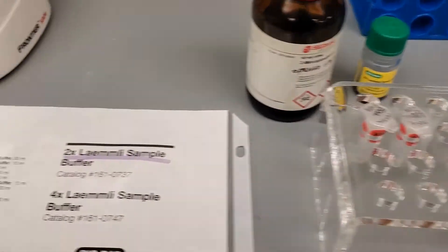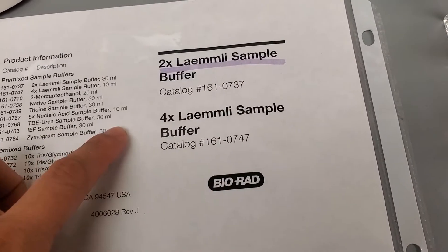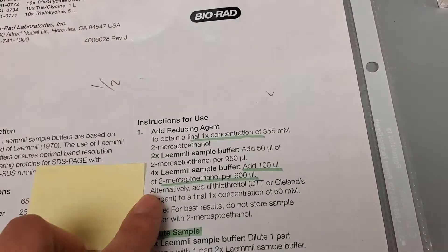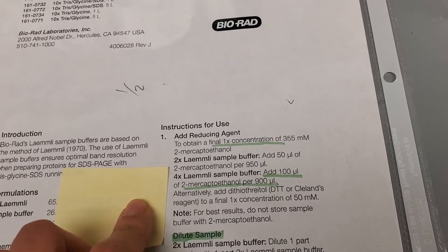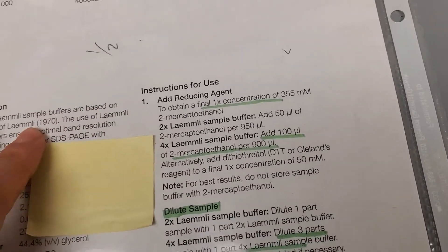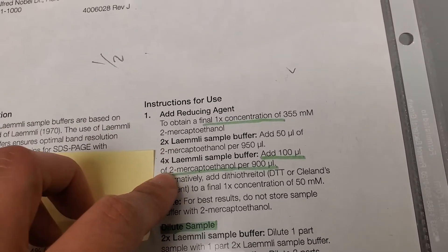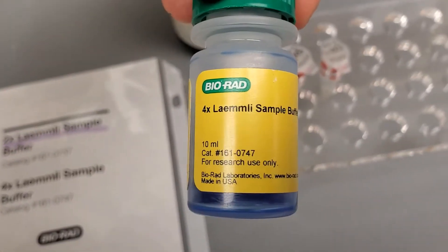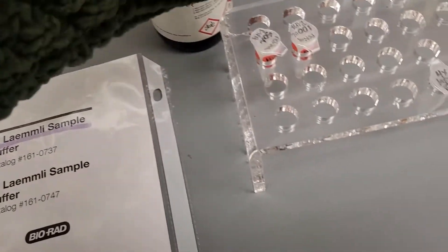For that, I use the Bio-Rad 4X Laemmli sample buffer. The first thing to note when looking at the protocol is that it's very important that you have the protocol for the 4X and not the 2X, so you need to make sure that you have the appropriate Laemmli buffer.